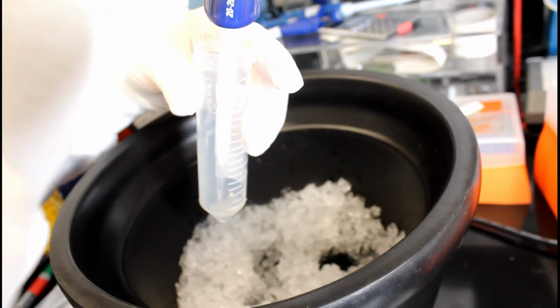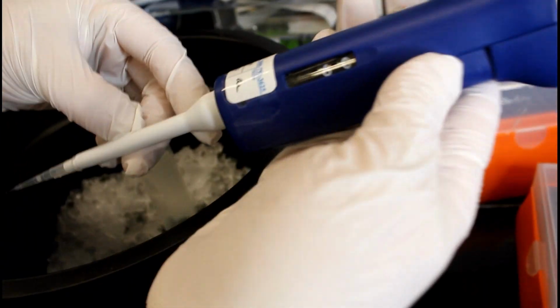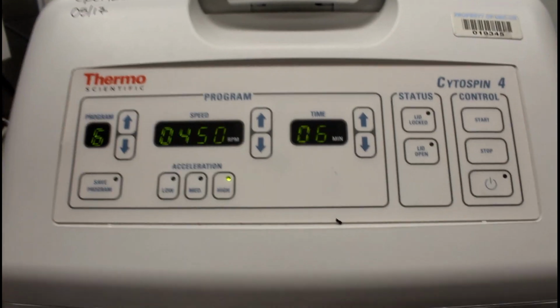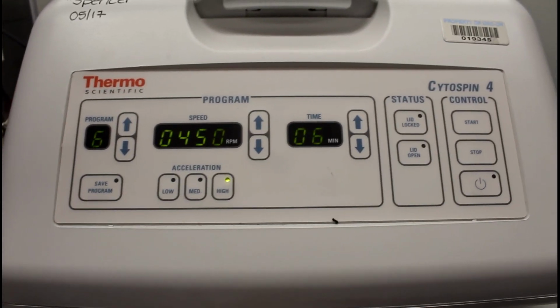To make cytospins, the sample needs to be at a concentration between 500,000 to 1,000,000 cells per mil. Load the cytospin by putting 60 microliters of cell suspension into one setup. You will make a total of 4 cytospin slides, if possible.